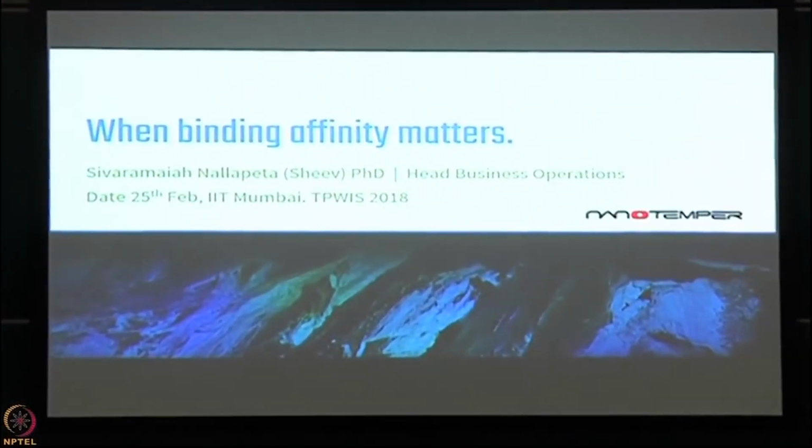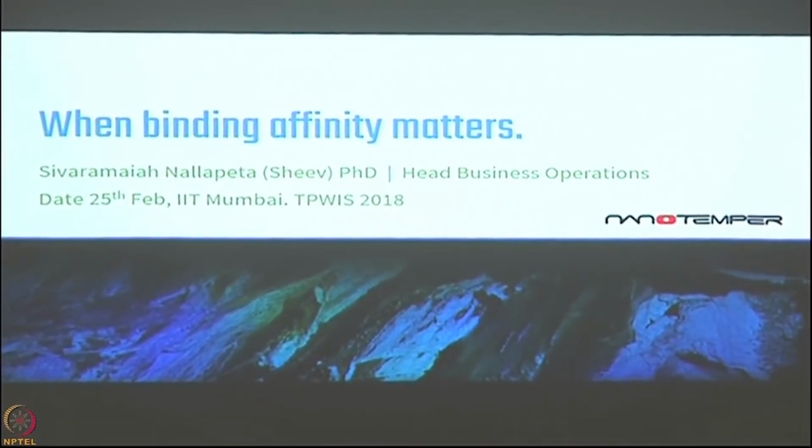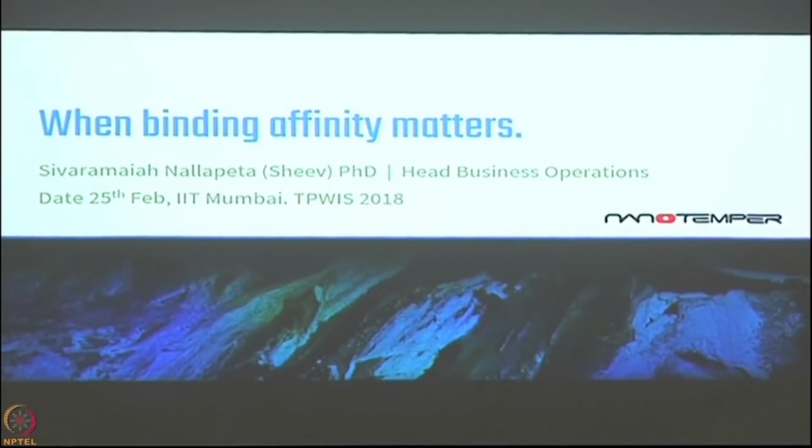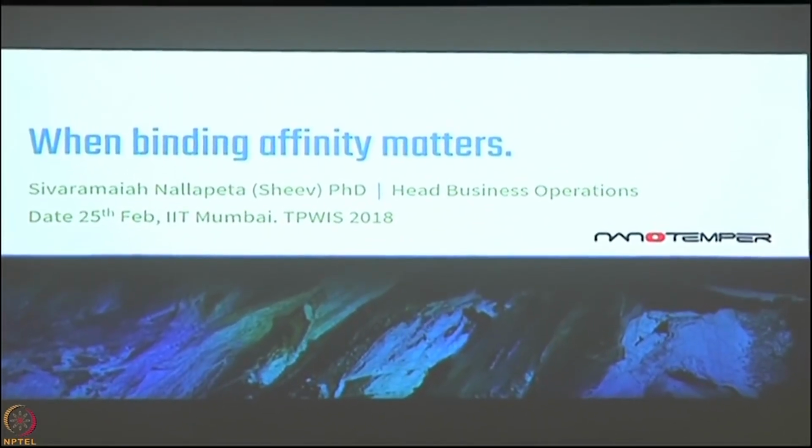Okay, great. So, this is a biophysical technique that determines binding affinities. As I said, this is a technique about binding affinities, how you determine the binding affinity between two biomolecules. It can be anything, protein, small molecule, protein ligand, anything you can determine the binding affinity.